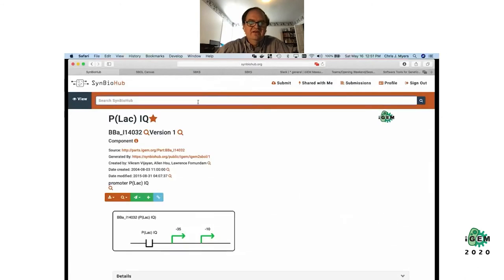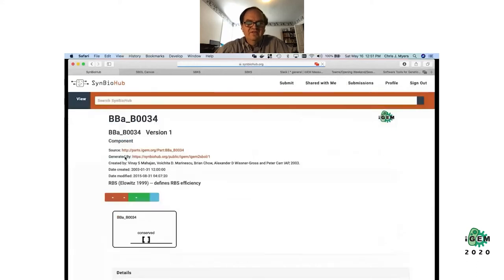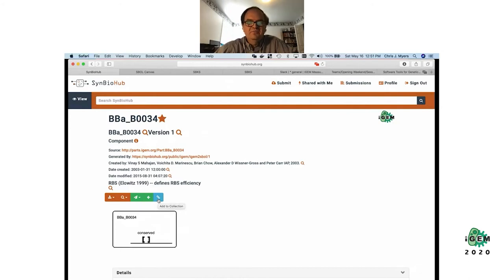I'm also going to need some ribosome binding sites, so let's go shopping for some. One thing the search is doing is sorting those results using similar techniques that Google uses to sort them by relevance to your search query as well as how likely they are to be useful — usually calculated by looking at how often a part has been used. This ribosome binding site has been used quite a lot, so let's stick that one into our part cart.